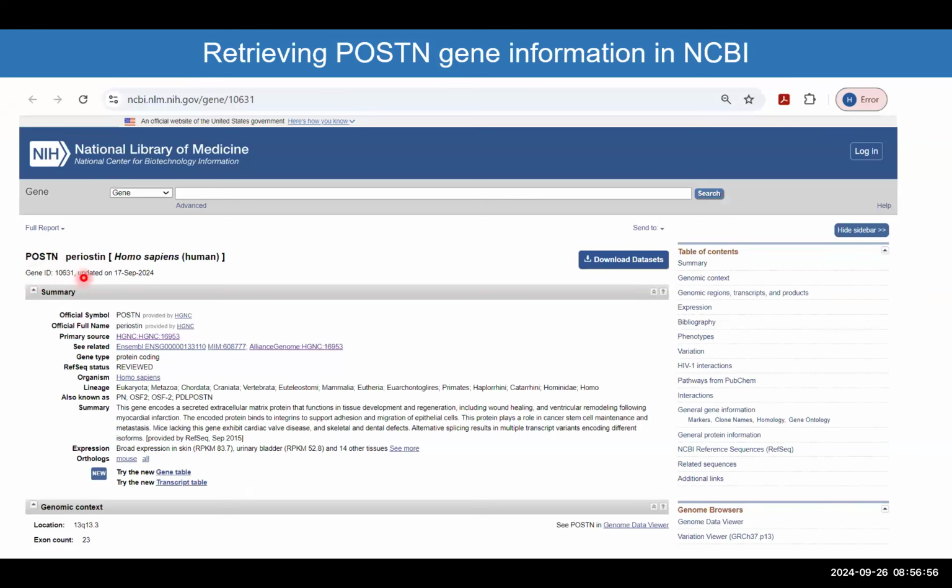So that's the same ID. Anyway, if you click on those links, there's no way that you will miss. But if you're looking on the NCBI, you have to be careful that you got there, because there might be multiple versions there too. And again, here, it will tell you a lot of information about the gene and how you can retrieve the sequences.